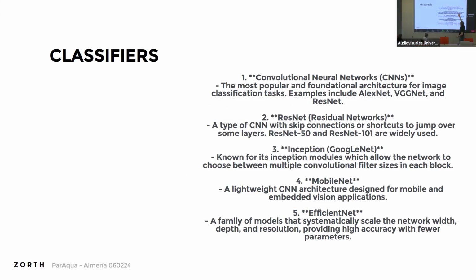ResNet, this one is the winner for me. That's a neural network that is included in all the packages. If you've got large images and a large amount of data, you can use a ResNet 101, which is very, very precise. Otherwise, default to the ResNet 50, you will never be completely disappointed. Trust me. Inception, MobileNet, EfficientNet. Inception, MobileNet, I don't see the use for it since ResNet is so good.